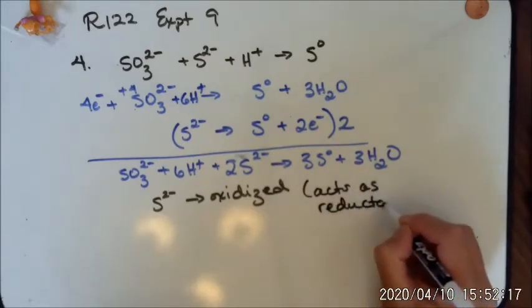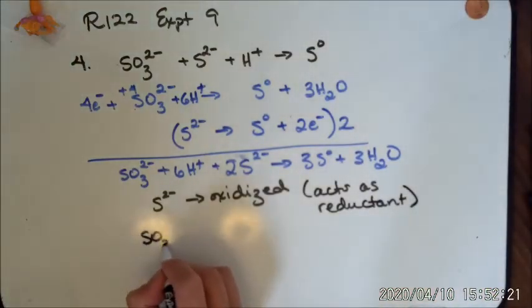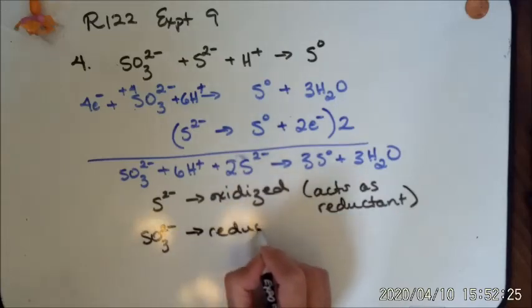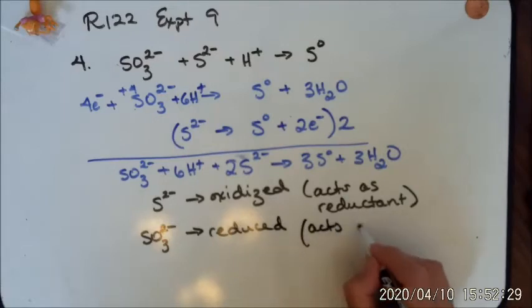Okay, and the sulfite gets reduced, so it acts as an oxidant.